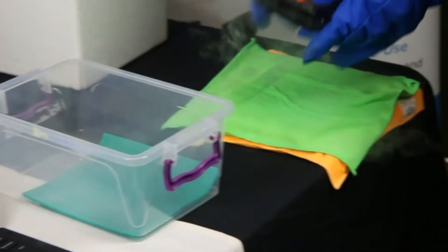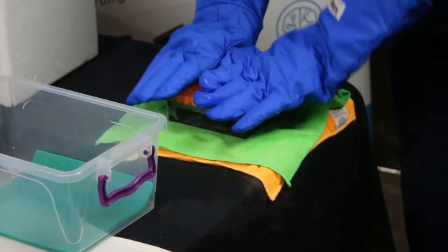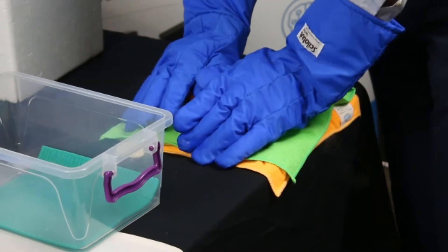Next, to remove the excess ethanol, let's place it on our blotting station. Press it firmly down again.